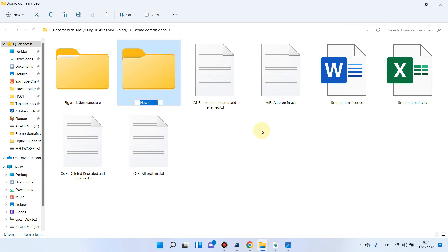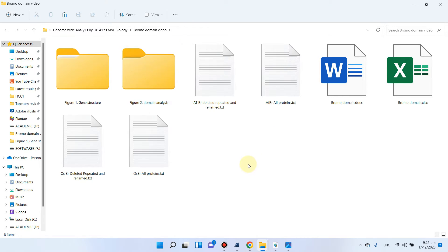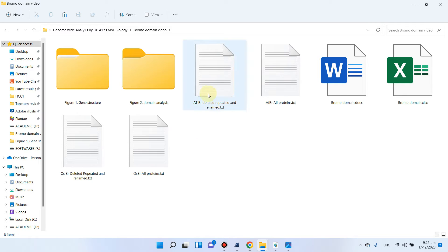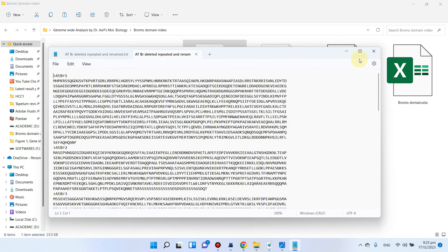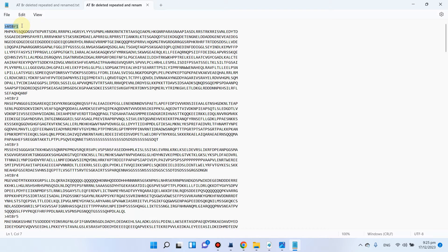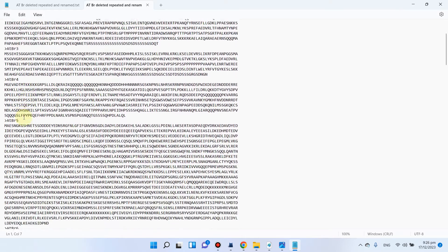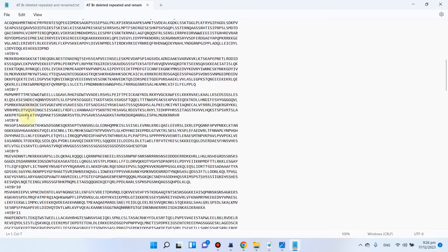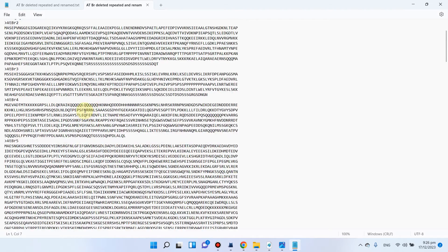This will be our Figure 2 folder, which is domain architecture analysis. We will be using a file where, as covered in the previous video, we had two examples — one from Arabidopsis and one from Oryza sativa. In this file we have already deleted the repeated sequences and renamed them according to the sequence. If you don't know how to rename them, you can watch the previous video.